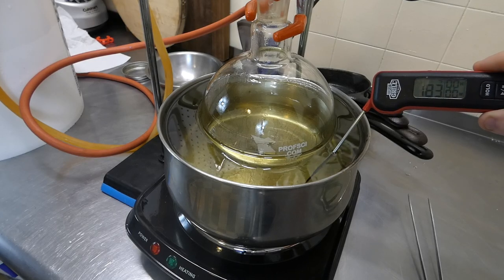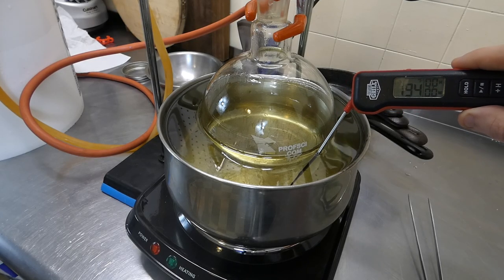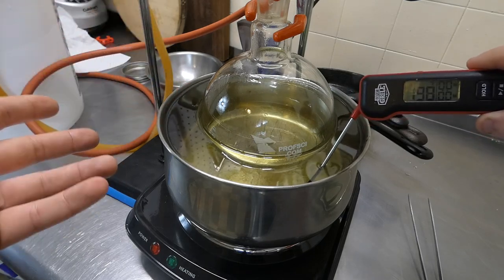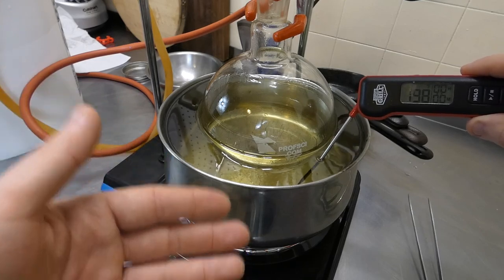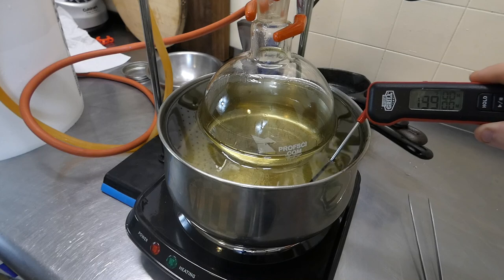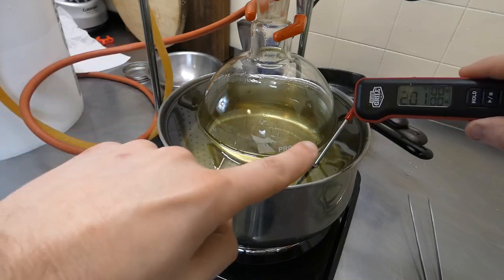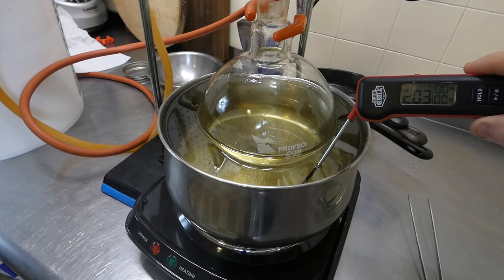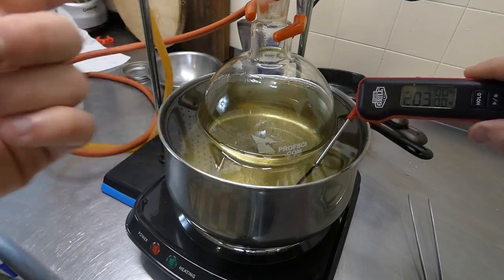This right now is almost at 200 degrees Fahrenheit. The liquid inside, the ethanol inside the flask, is actually a colder temperature than the oil itself, so that takes time for that to heat up inside. Once this starts to boil, we're gonna take the temperature here and bring this down to about 173, 174 to keep this at a continual boil.